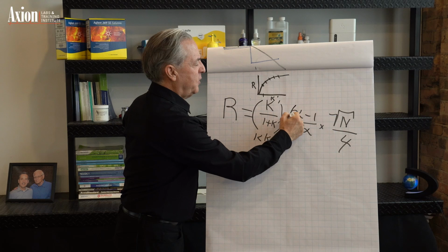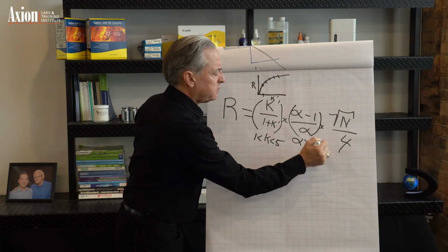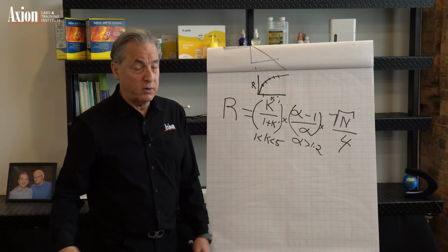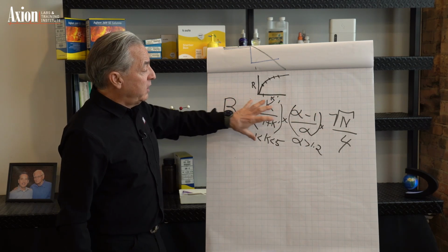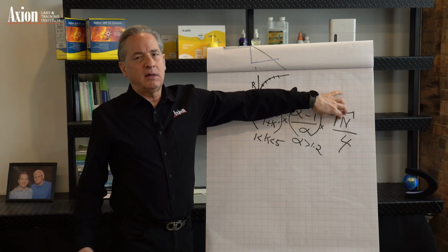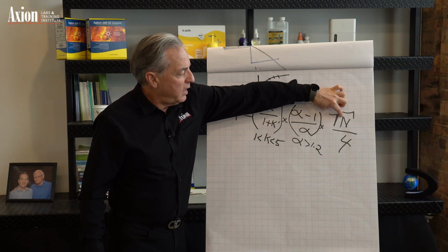Selectivity. I know the question was in there. So we always say alpha should be greater than 1.2 for LC, for packed columns, and 1.05 for GC, for capillary columns. I look at this as a very empirical equation. And I look at it this way. We have efficiencies. We know what these numbers are. In LC, we get 10, 20, 30, 35,000 plates if we're really, really lucky in LC.